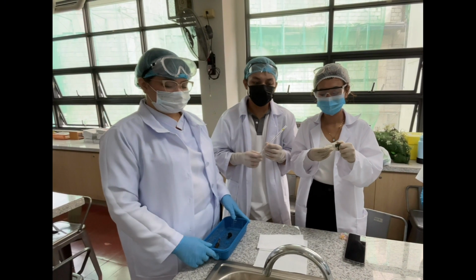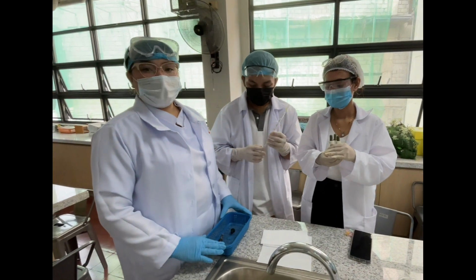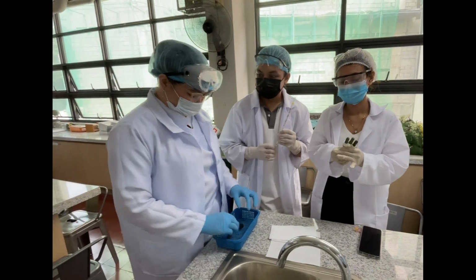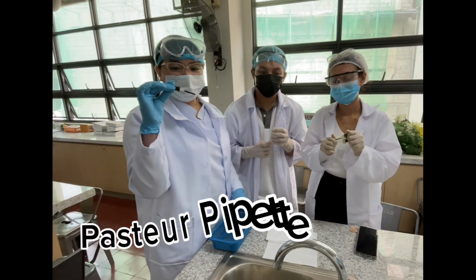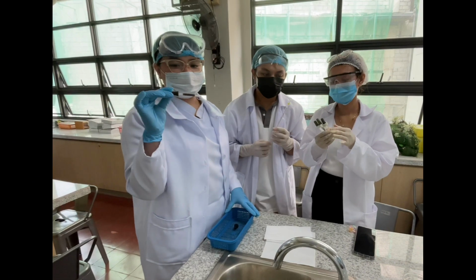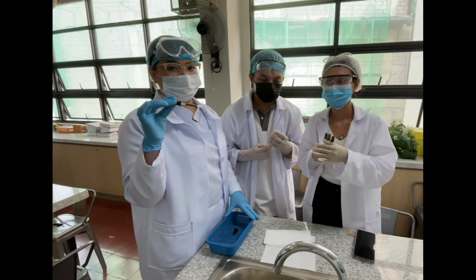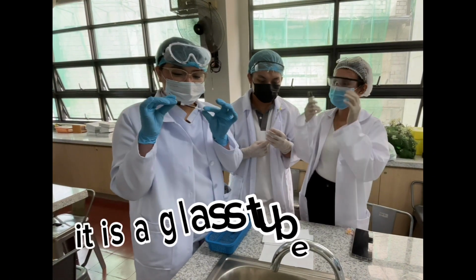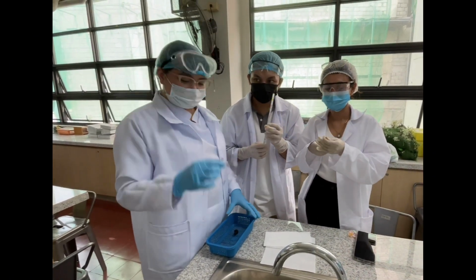So hello again guys, nandito na kami sa Station 2 to explain what these equipments are. First, this one is a Pasteur pipette. It is also called a dropper. It is used for transferring liquids or samples in laboratory workflow. It is a glass tube with a rubber bulb on top.